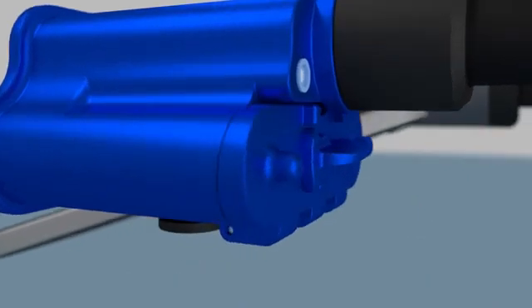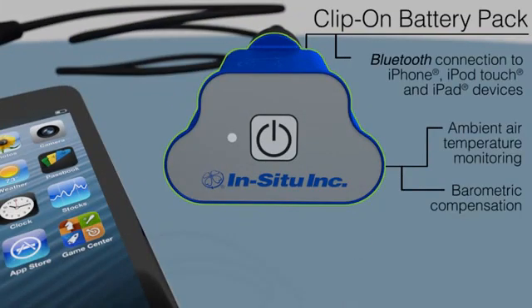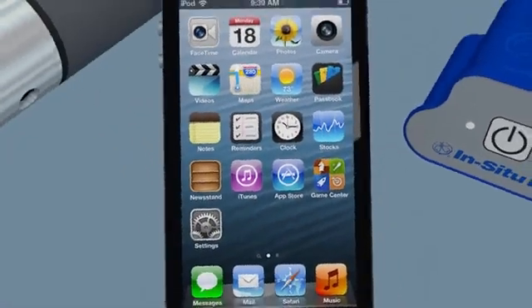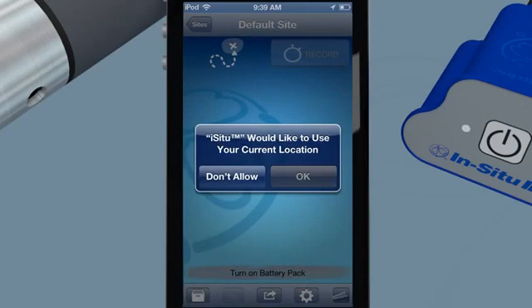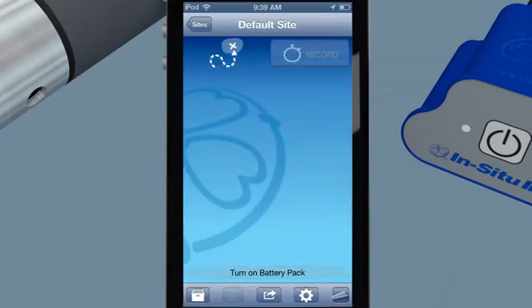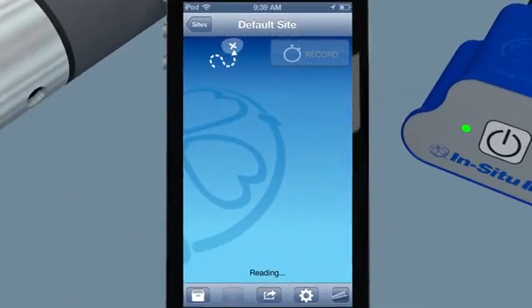Bluetooth communication between the handheld and your smartphone provides a secure wireless data stream. The battery pack measures ambient air temperature and barometric pressure for live compensation of water level and dissolved oxygen readings. You can purchase the In Situ app easily using the iTunes Store. Push a single button and the LED lights on the battery pack indicate whether you have made a connection to the app via Bluetooth.